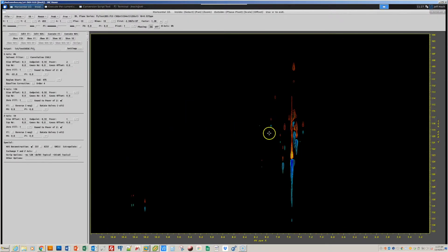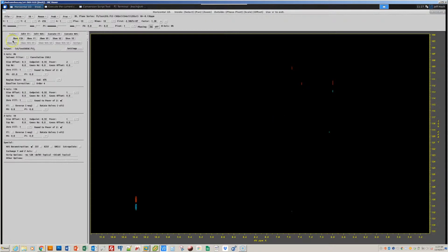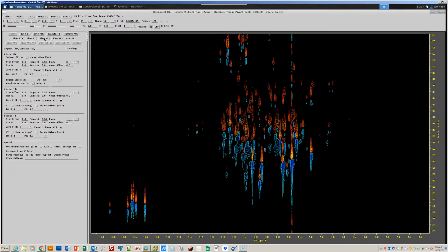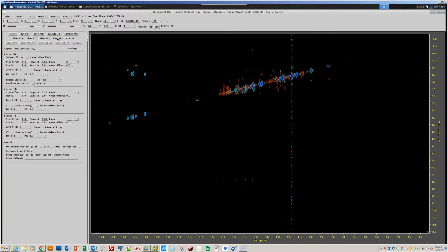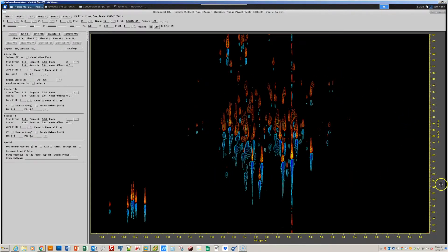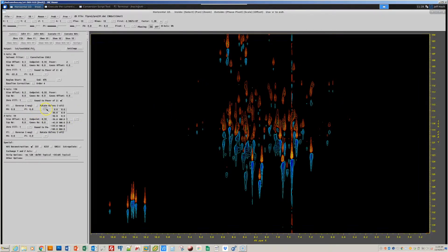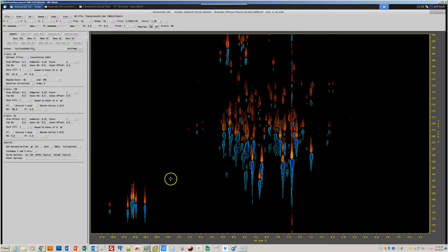In the case of 3D data, when we look at planes from the 3D data, which we're doing now, it might be hard to kind of fathom what's happening. So, as a convenience, there are buttons in this interface that will let us see the 2DXY projection of this 3D data, and the 2DXZ projection of this 3D data. So, when I look at these projections, I notice two things. When I look at the proton-nitrogen dimension, I can see that this nitrogen dimension looks like it's about 90 degrees out of phase. This is a common circumstance for gradient-enhanced data, so I will set the phase correction value to exactly minus 90 for the nitrogen direction.